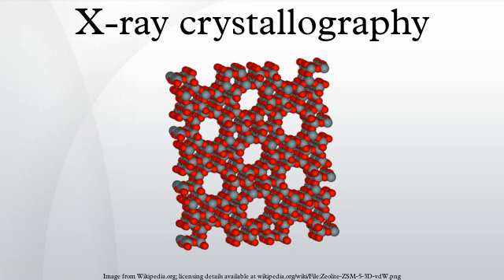Laue scattering provides much structural information with only a short exposure to the X-ray beam, and is therefore used in structural studies of very rapid events. However, it is not as well suited as monochromatic scattering for determining the full atomic structure of a crystal and therefore works better with crystals with relatively simple atomic arrangements.